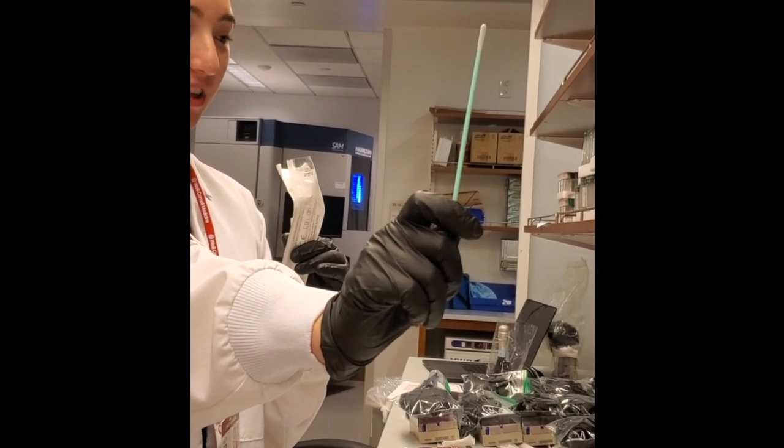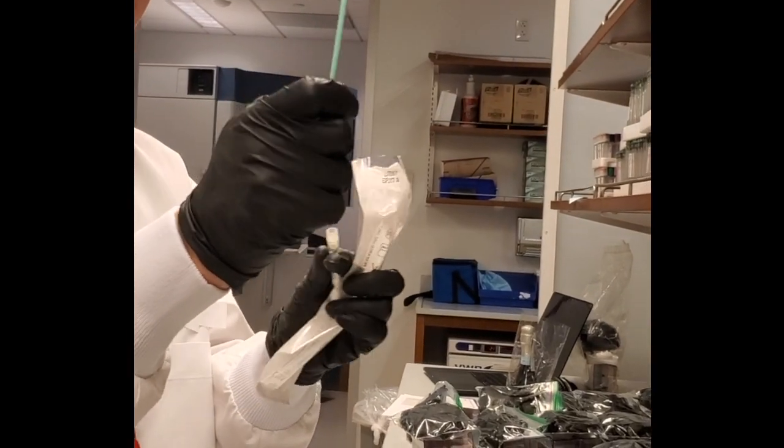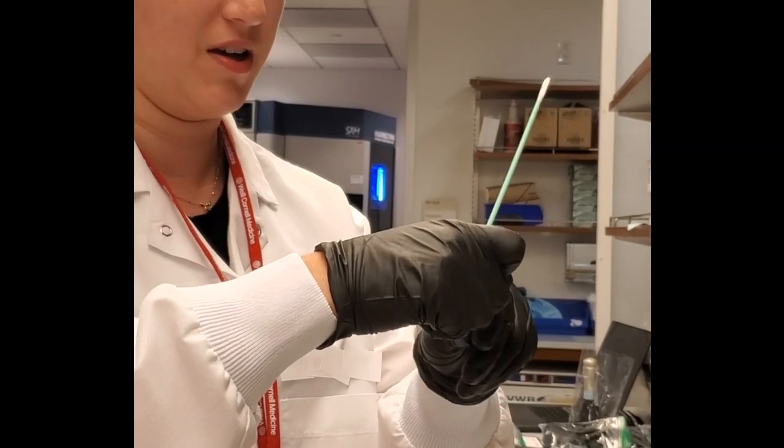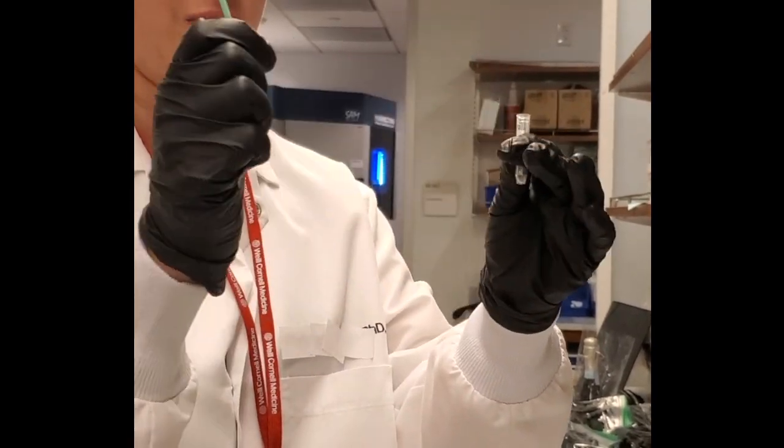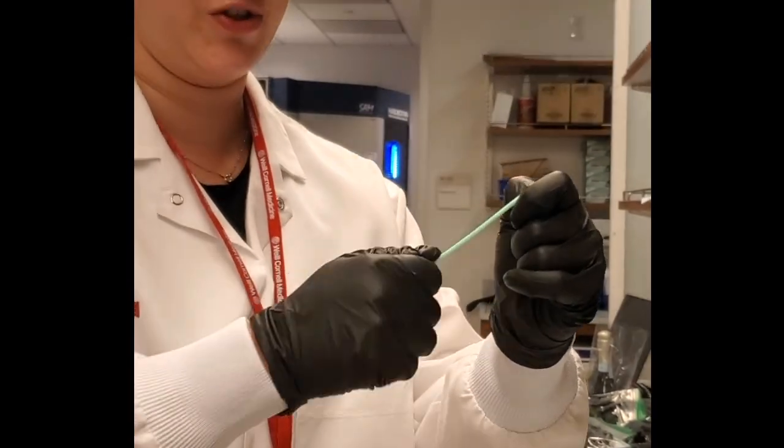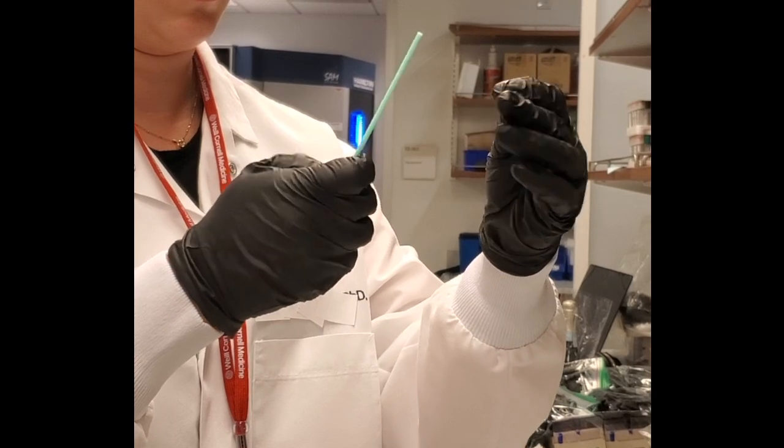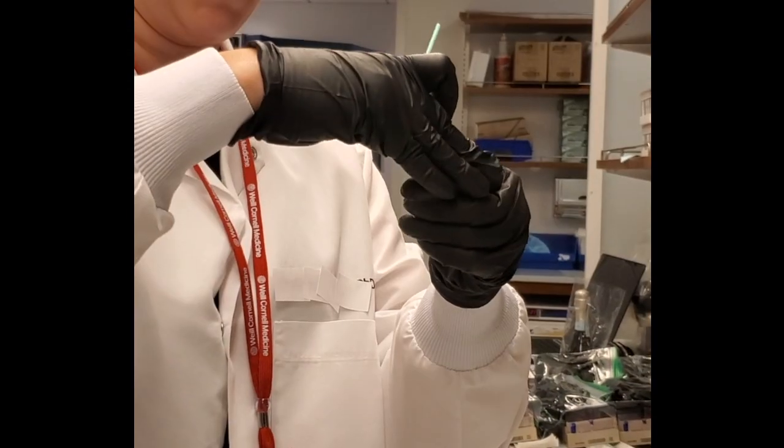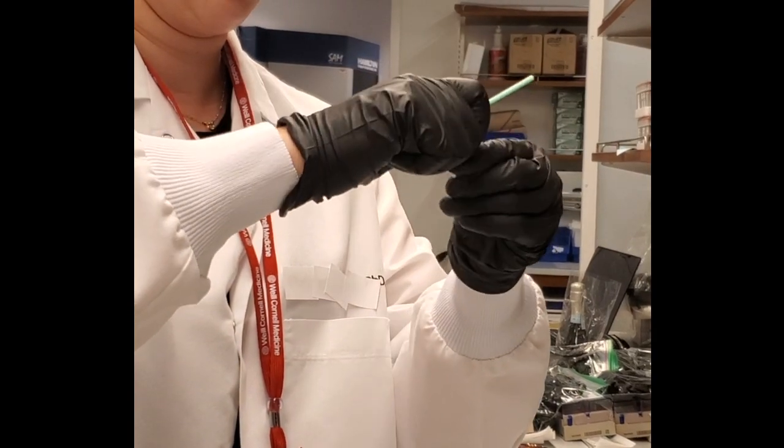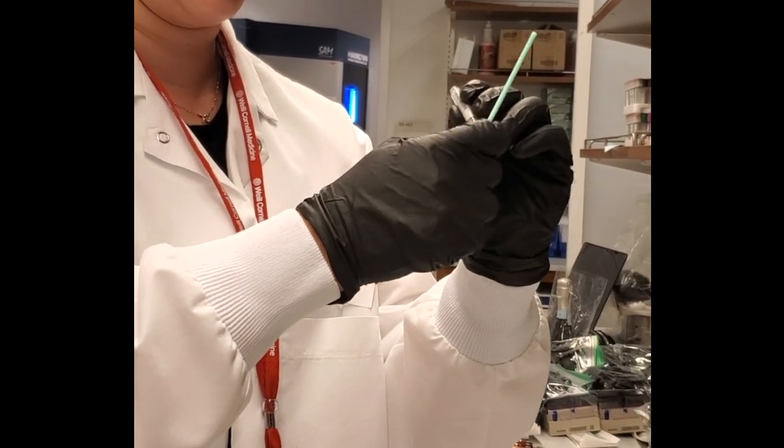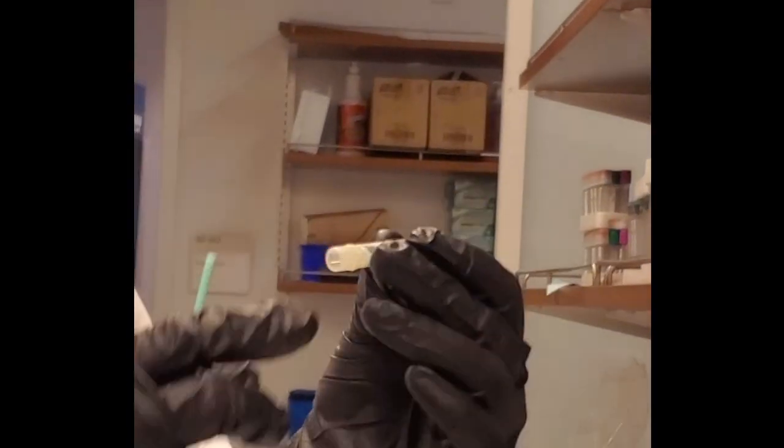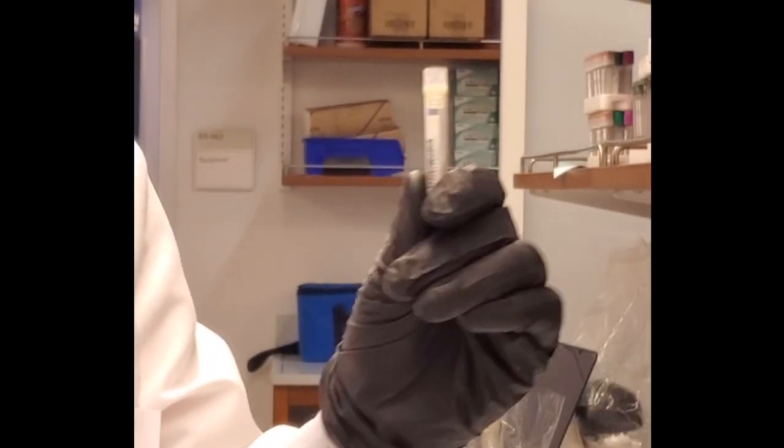Once you are done, take it and just as if you were performing an experimental sample, take your swab and snap it off into your tube, close it, and make sure to mark down the bar-coated tube. You have completed one negative control.